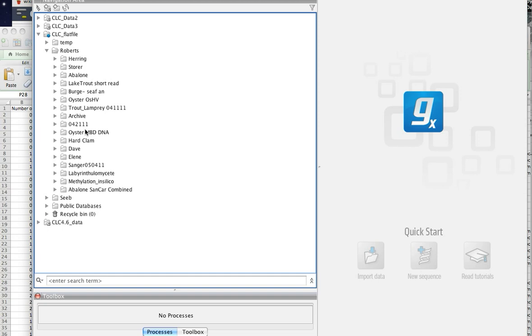No. Now we're going to do the comparison part. So what do you want to compare? San Nicolas next to Carmel's, infected? Yeah, I guess both of them infected, because what I'm looking for is disease resistance genes, right?